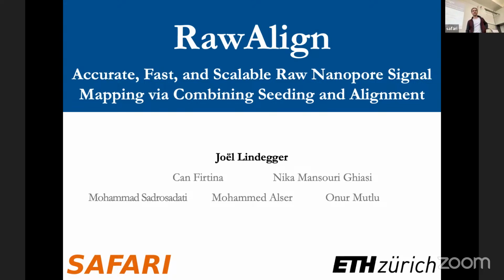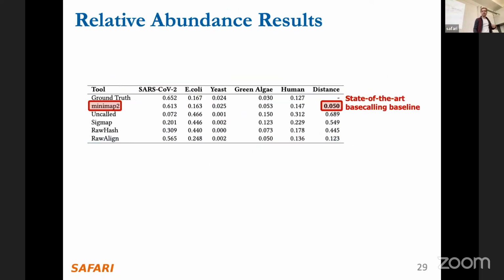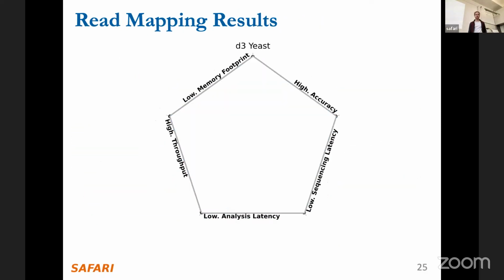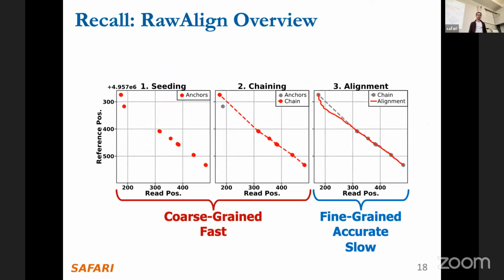Yes. Can you maybe go back again to the three graphs? Yes, you can. So the data that we get from the sequencer is an array which spans basically the entire x-axis.